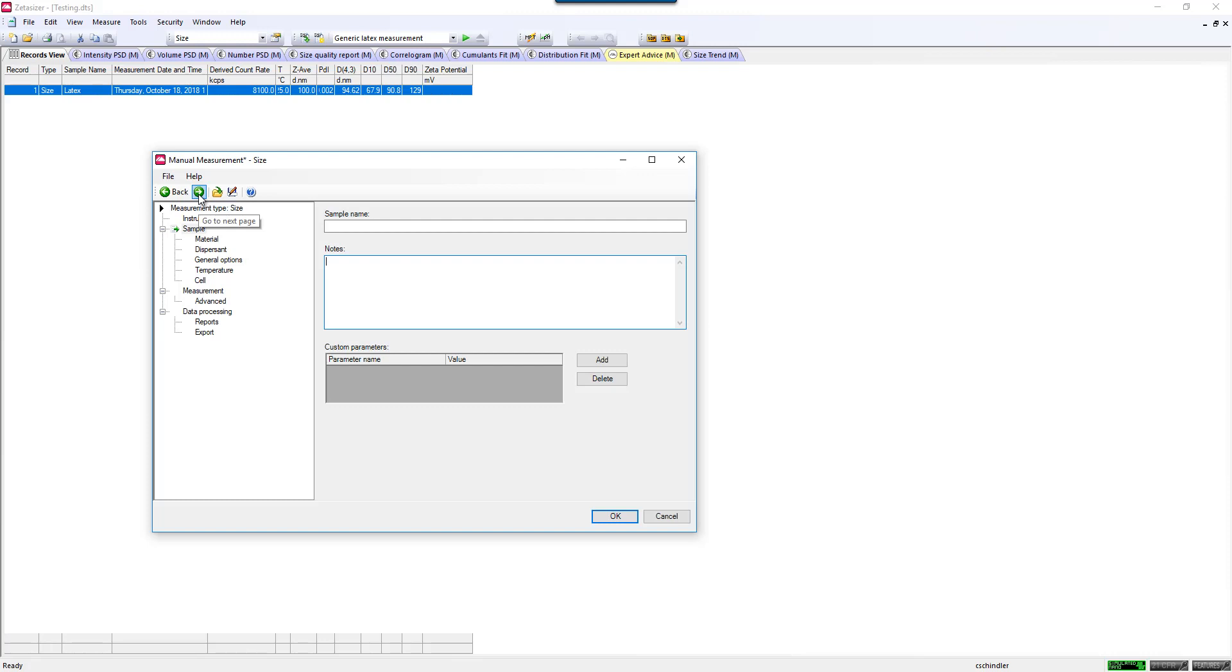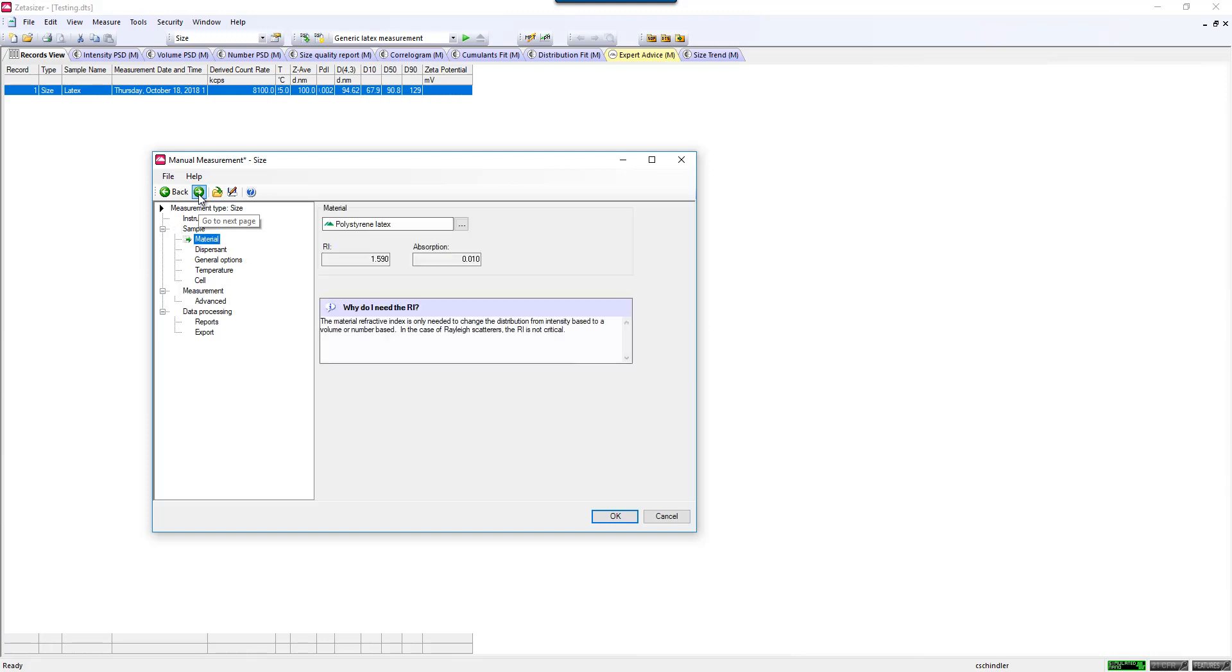If you tab down to the next parameter, you can enter the Materials Refractive Index. Please note, this is not a critical parameter to enter if you're only looking at the intensity size distribution. If you're interested in the volume distribution or number distribution, you would want to enter in the Materials Refractive Index.